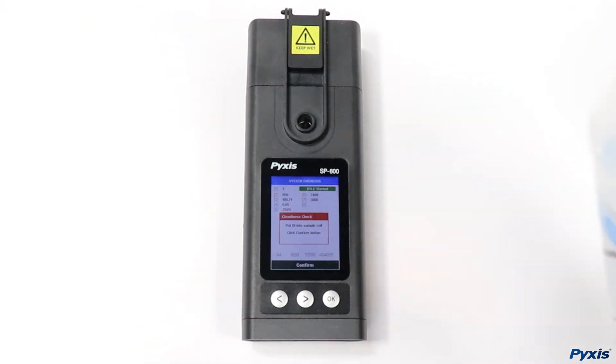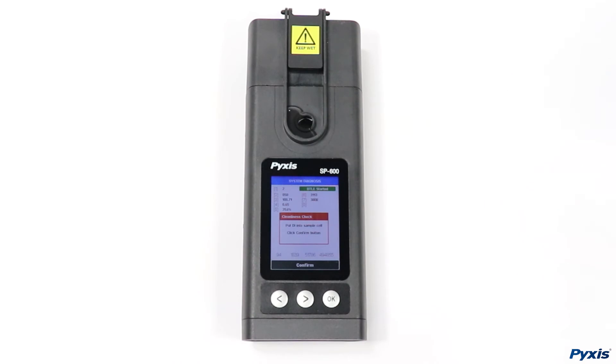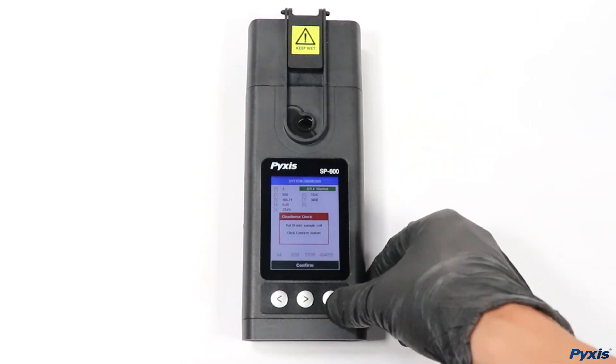Insert DI water into the sample cell and select confirm. Your unit will check the overall cleanliness of the device and will notify you of its current state.